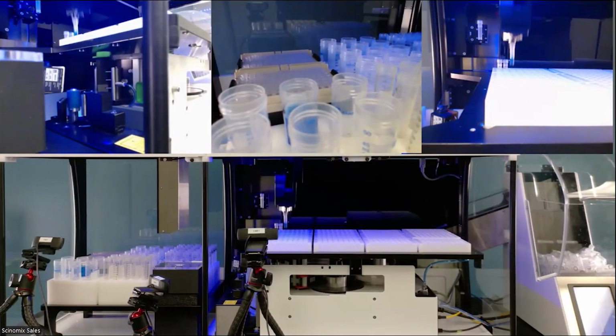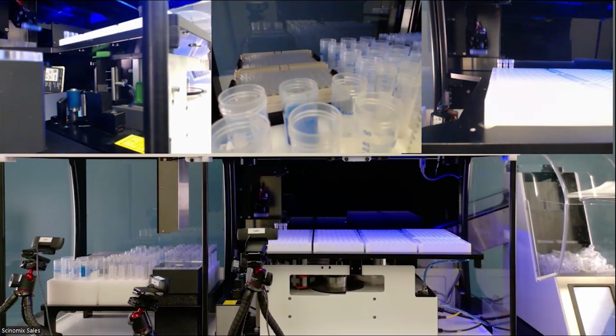Once the run is done, it's going to clean itself up. It disposes of its pipette tip into the waste container so that we don't have any contamination there. And then it's going to alert the users that the run was done, and now they can interact with these tubes and send them to whatever downstream process they would like.